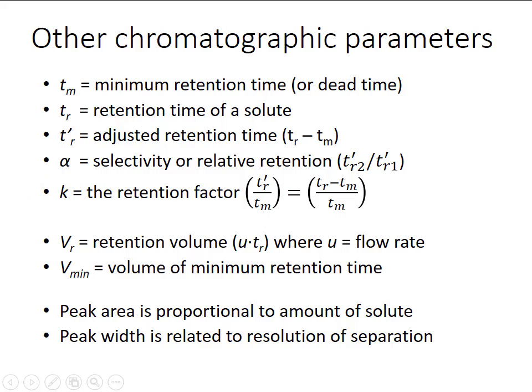Finally, I want to again emphasize that beyond the location of the peak in time, the area under a peak is proportional to the amount of the solute, and when examining parameters related to the quality of separation, we often will look at the peak width as it is related to the resolution of separation, as you'll soon see.